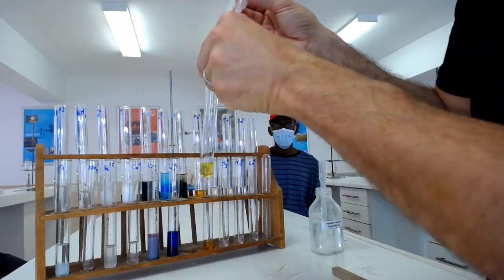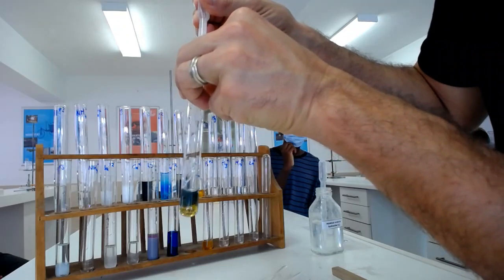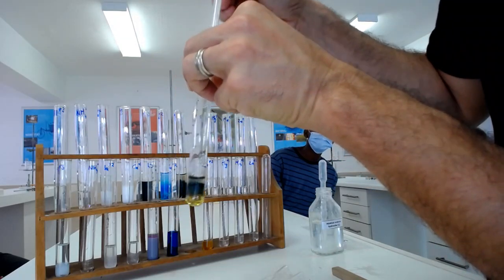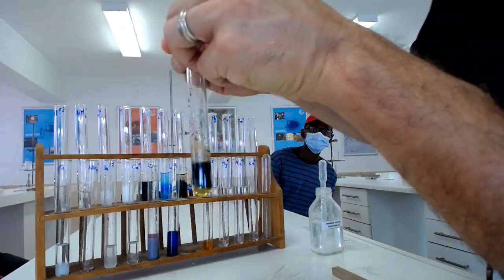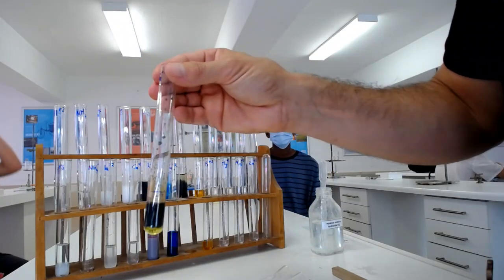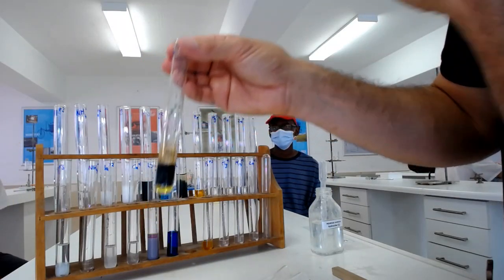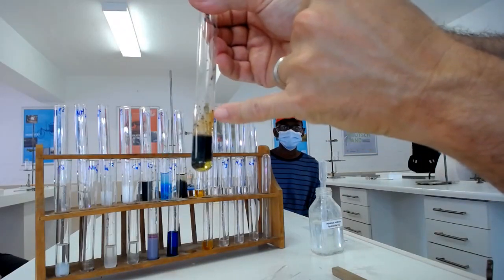What about Fe2+ with ammonia? Oh, same thing. And what happens if I add more? Also insoluble. But have a look at what is happening to my test tube.